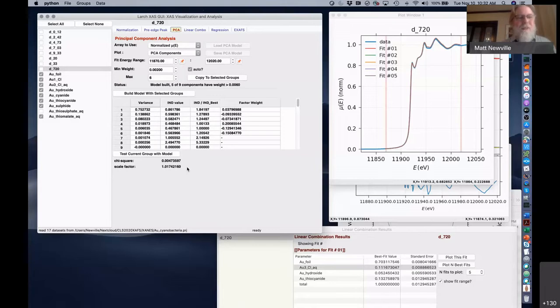And it seems like with MCR ALS, there is always a question that it can give you hard to understand or hard to believe results. And yet it always presents itself as being an answer. I think that's a large part of it, is vetting the quality of the results. So I played around with it, and if someone was interested in implementing that or helping, or had good test data and results, I'd be happy to work with them on that. I think that getting quality assurance is the hardest part.